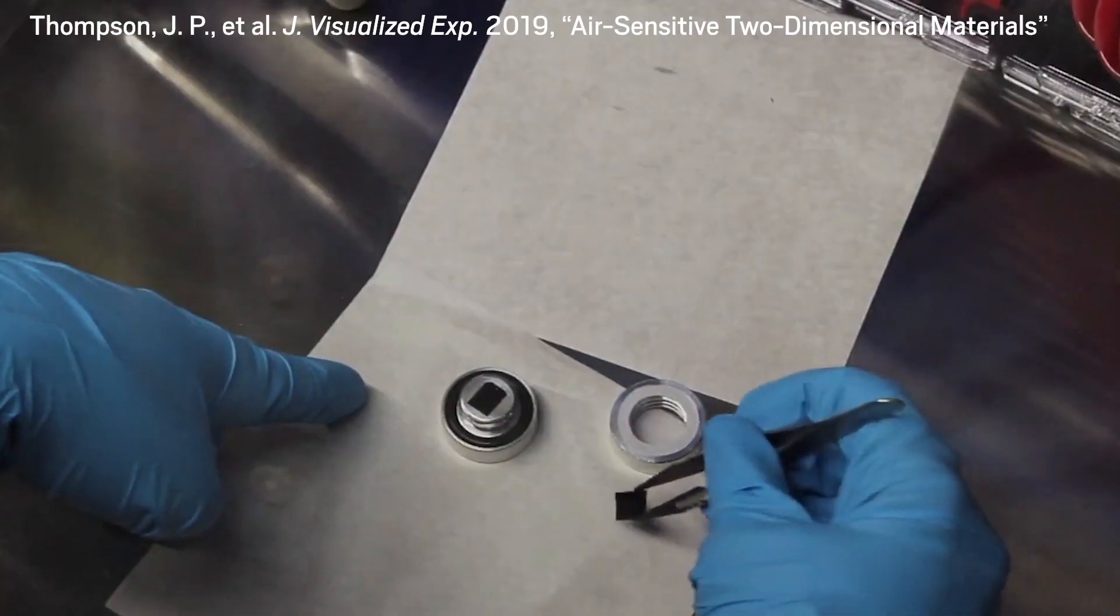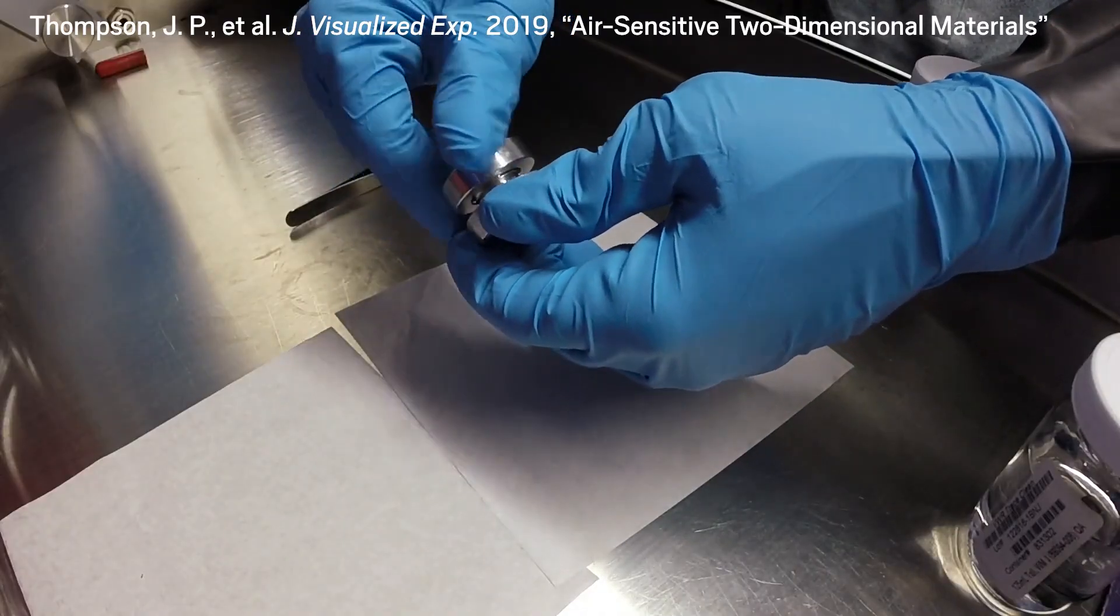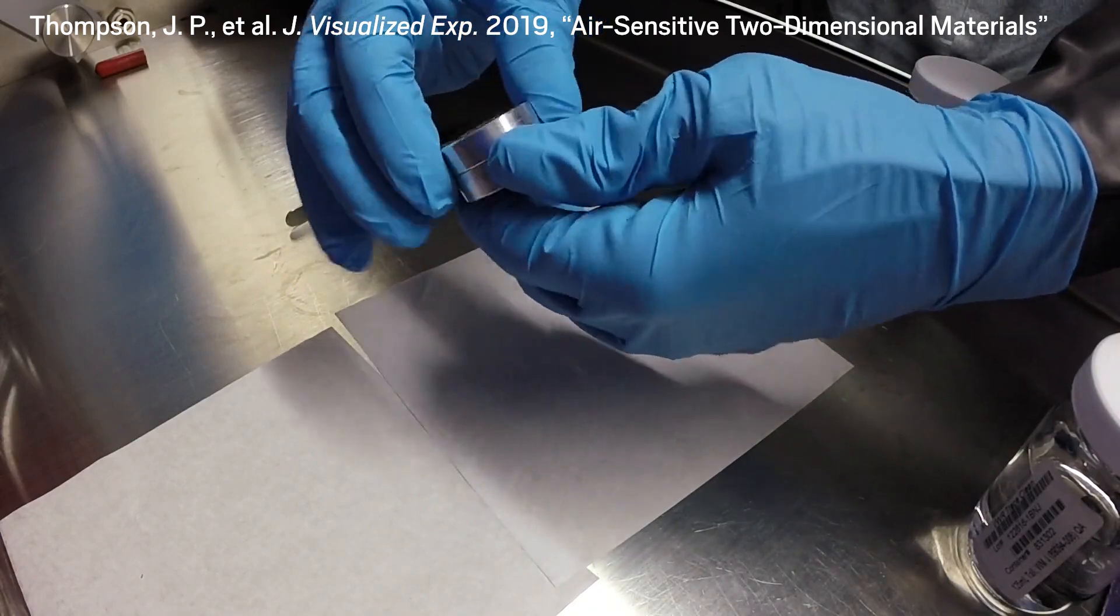While working inside a glove box, researchers place a sample into the cell. Then they screw the two halves of the cell together, creating a seal that will maintain an inert environment even when removed from the glove box.